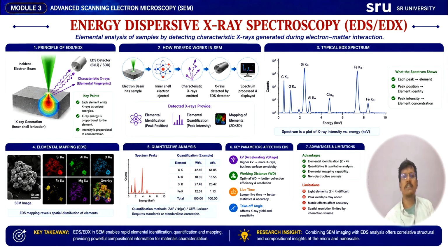In nanomaterials research, EDS is routinely used to verify doping, confirm the composite formation, detect impurities, and evaluate elemental homogeneity.